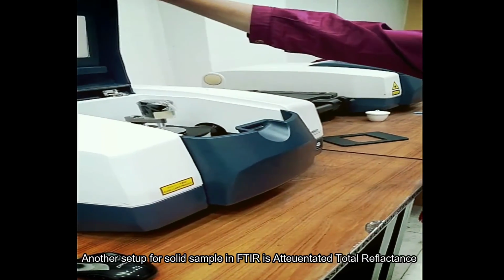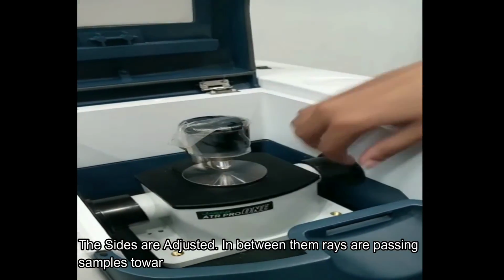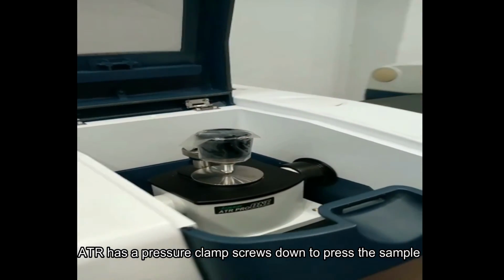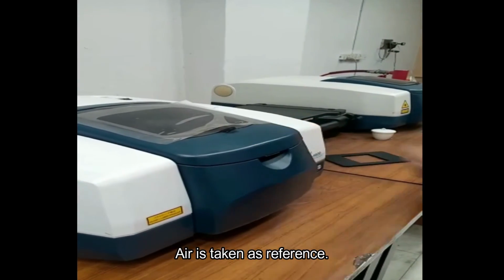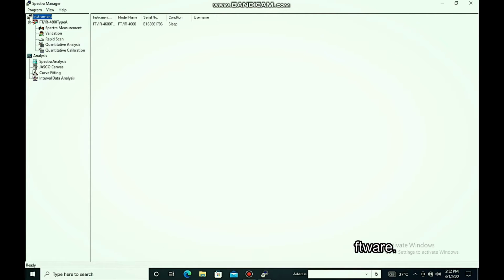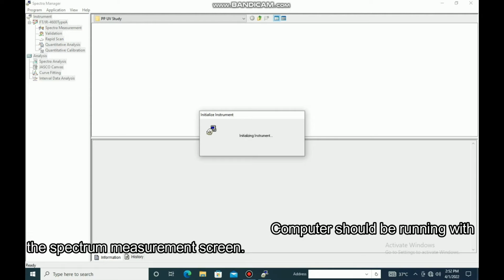Another setup for solid samples in FTIR is attenuated total reflectance. The sides are adjusted, and in between them the rays pass from the sample towards the detector. ATR has a pressure clamp which screws down to press the sample. Now air is being taken as a reference. The FTIR is controlled by computer software. To obtain a spectrum in the lab, the FTIR computer should be running with the Spectrum Measurement screen.